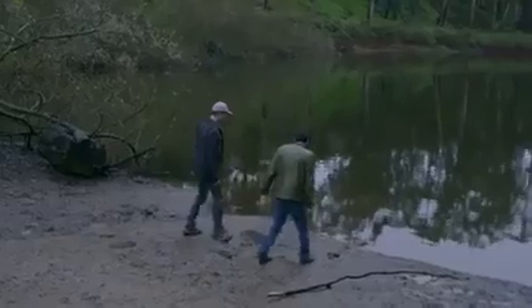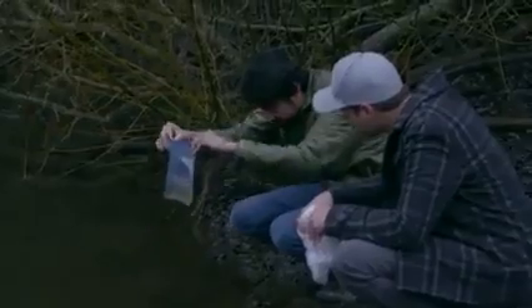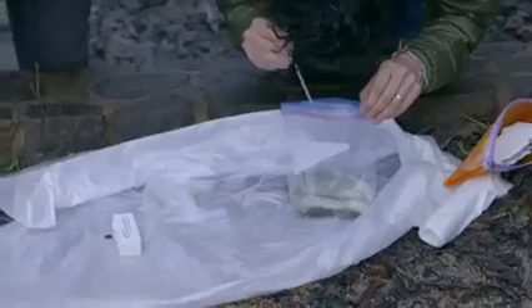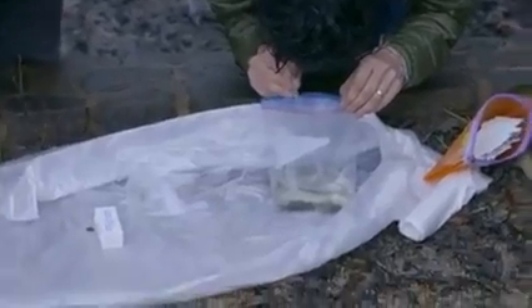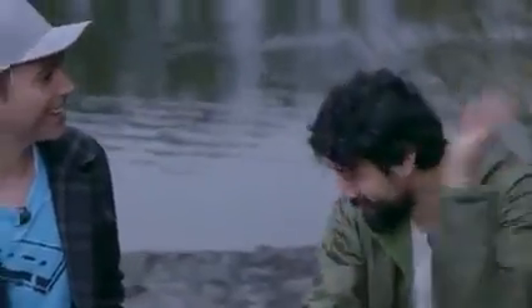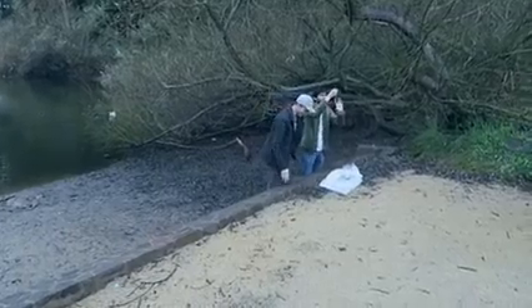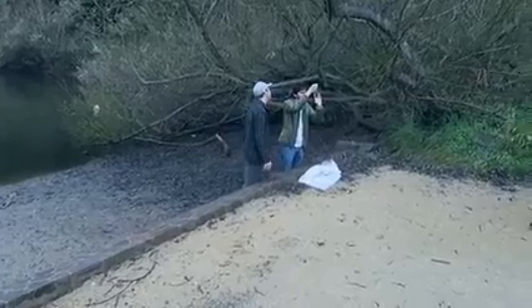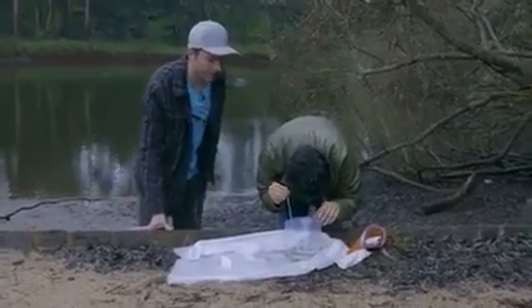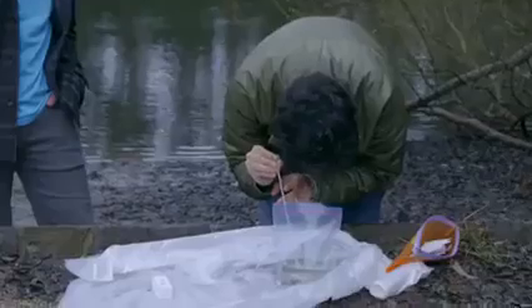I wanted to test drive this paper microscope. We got a scoop of seemingly clear water from this pond, and there was one tiny white speck that didn't settle to the bottom of our bag. Manu suggested we take a closer look. They can sense suction and they run away — it's kind of like a fly when you're trying to swat it. It senses your hand coming before it comes. It realizes, just like it's about to go into the mouth of a fish, it runs away.